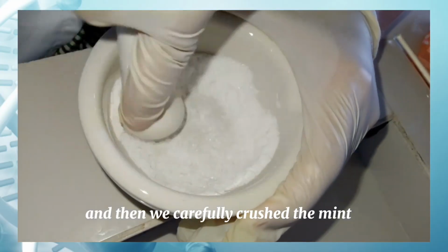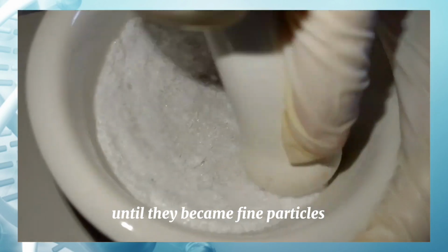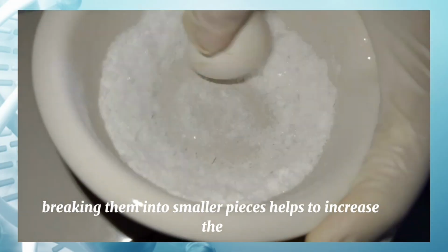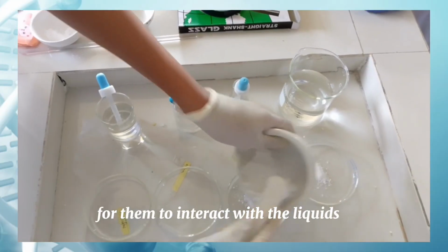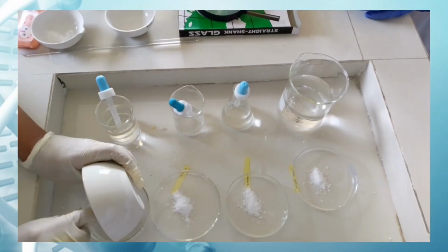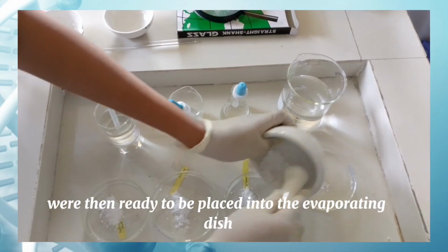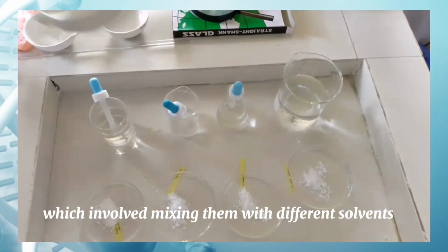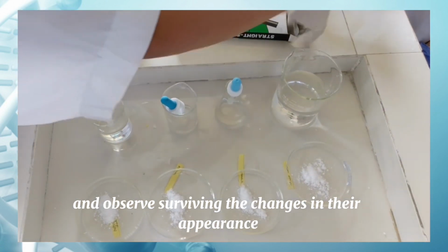And then we carefully crushed the mint candy and the tawas crystal until they became fine particles. Breaking them into smaller pieces helps to increase the surface area of the substances, which makes it easier for them to interact with the liquids that will be added later in the procedure. After crushing the mint candy and the tawas crystal, the powdered samples were then ready to be placed into the evaporating dish for the next step of the experiment, which involved mixing them with different solvents and observing the changes in their appearance.